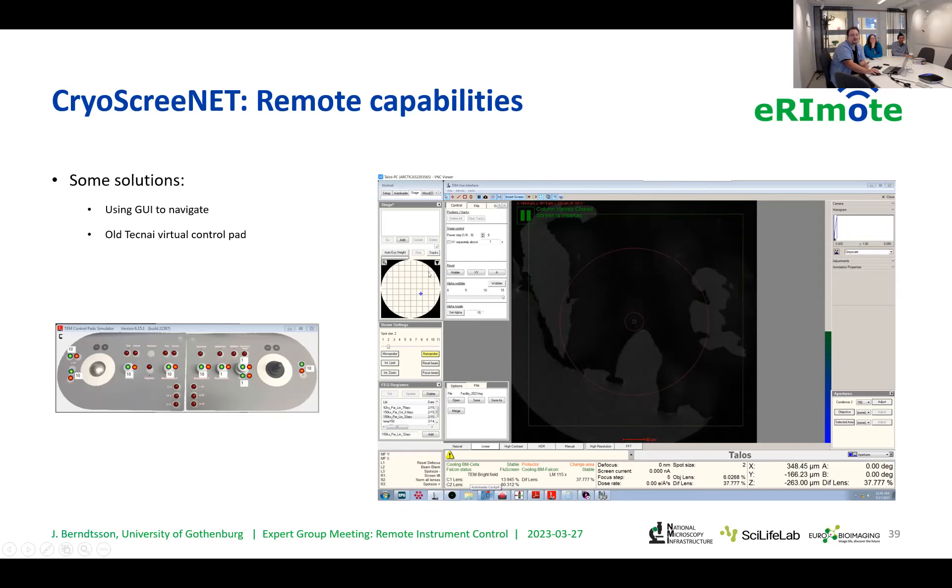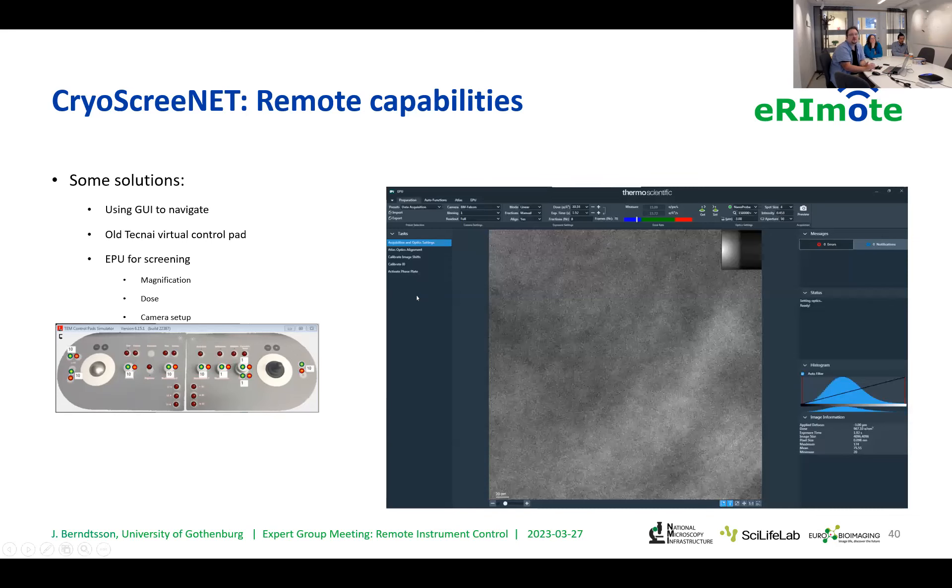This is the TEM user interface, and you can basically manipulate the X, Y, and Z coordinates in here. Another program we use a lot that Thermo Fisher provides in conjunction with their microscopes is called EPU. This is the one I use most of the time when I just want to manipulate things — you can easily control magnification, the dose of the beam coming in, as well as the various camera setups.